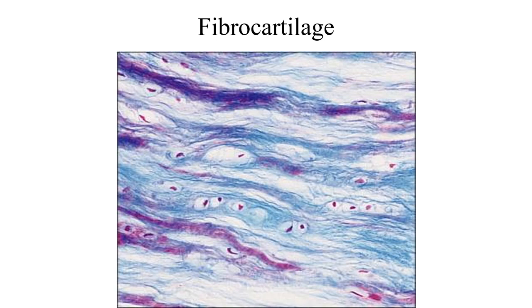Fibrocartilage, we're back to having collagen fibers again, but these collagen fibers are kind of long and wispy. It almost reminds me of taking a cotton ball and pulling it apart and shredding it. The fibers that are there are all going in that same pattern. They're also kind of in layers. And so we oftentimes see them in these layers, almost like layers of an onion.